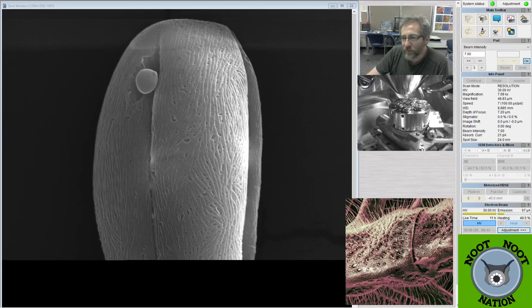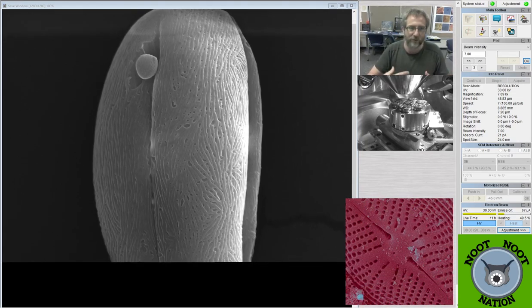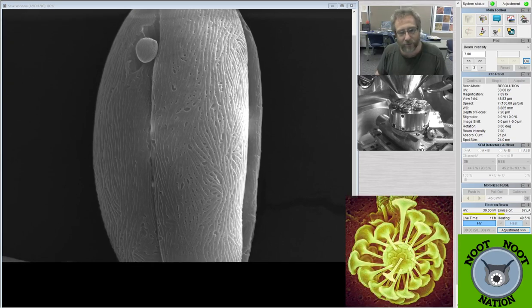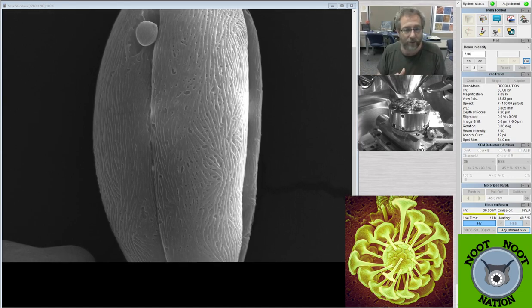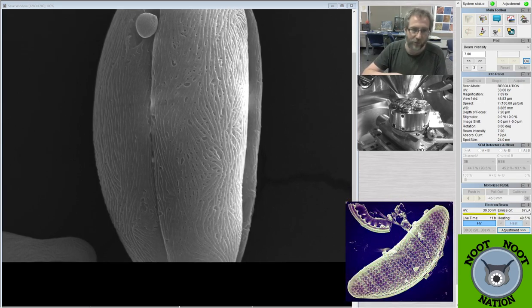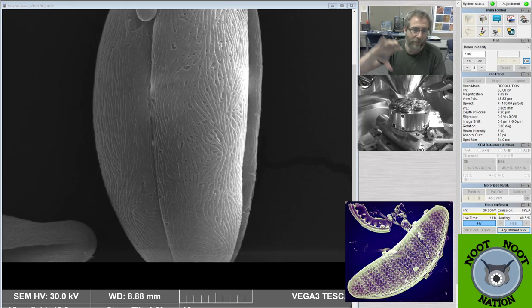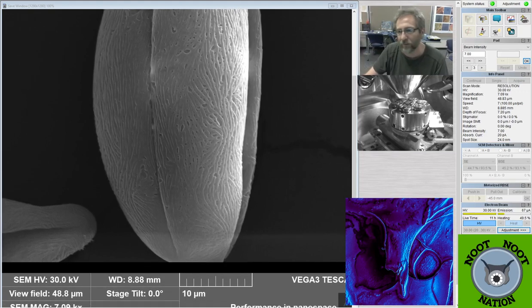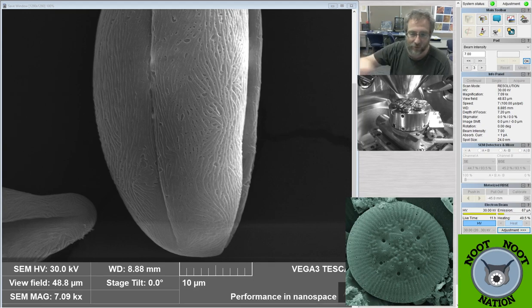What happens when it charges? Do you get large dark or light spots in the image due to electron charge building up on the sample? Yes. That's a byproduct of having a bunch of electrons focused in one place, and it means they're not escaping or rolling off of the sample very well. It can be because there's some inconsistency in the sputter coating, or some moisture in the sample, or because it's not got great contact with the carbon tape or the stub below it. If it's standing up on its end, that happens a lot. The higher it gets off of the surface, if it's sitting on a bunch of other junk, then you'll get these kinds of lines forming on it. It will charge up, and all the electrons sitting in one spot get detected by the sensor when it passes over, and it looks like a bright spot. The bright and dark spots are a consequence of that.